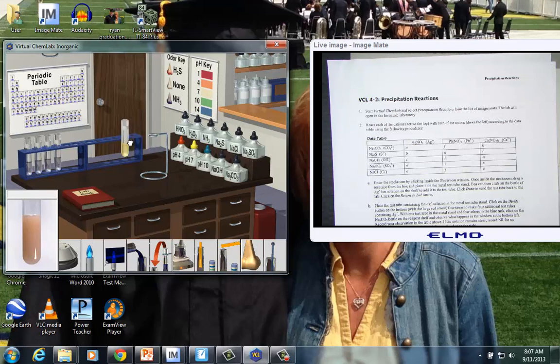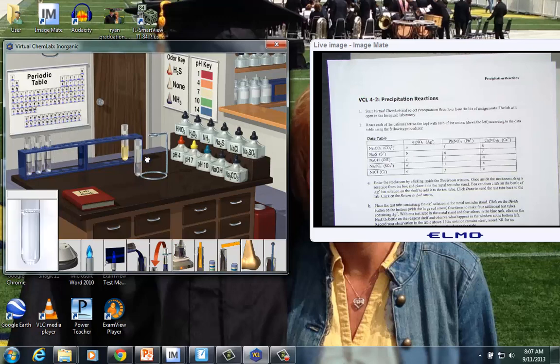So back over to my data table for the letter A box, I'm going to record, what do you want to call that, kind of like a brown, yellowish solid. So definite evidence of change.